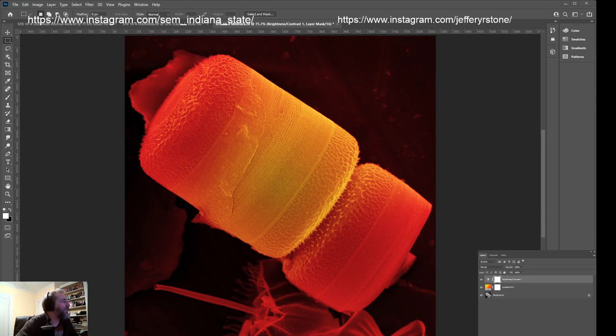Most of them extract as a murky brown or gold brown color. Yeah, I like to call that orange, Studio. The diatoms are orange diatoms, because I like orange, but it is sort of a browny gold orange.